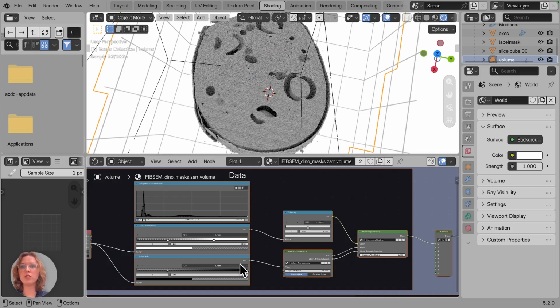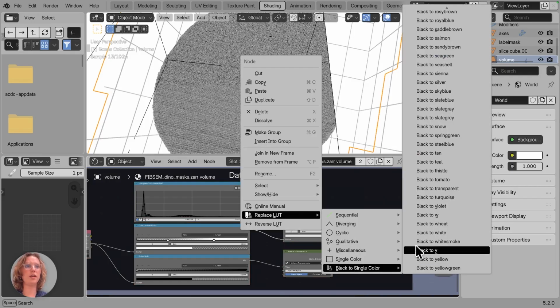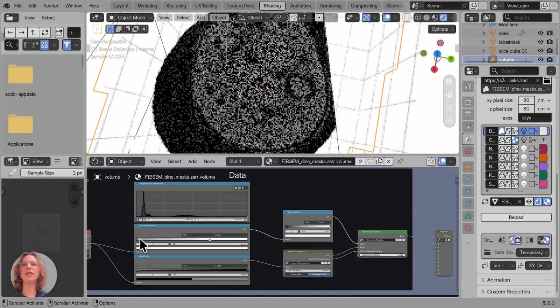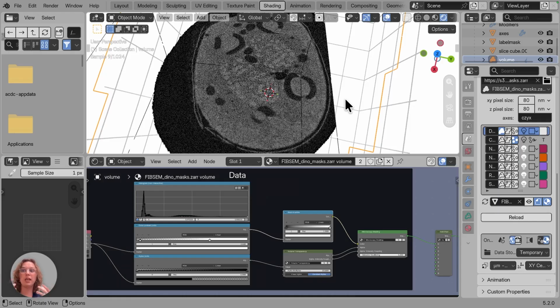But first, just to show how to make a normal EM render, you can just take the alpha limit such that it's just a completely dense block, and for example set the color from black to white. If we set it from black to white, we can set our range of color, and then we can get a normal sliced version of effectively an EM block. If we want to create a brighter version of this, we can change the strength of the background color to be even brighter or add more lights.